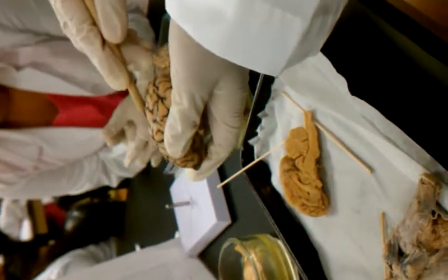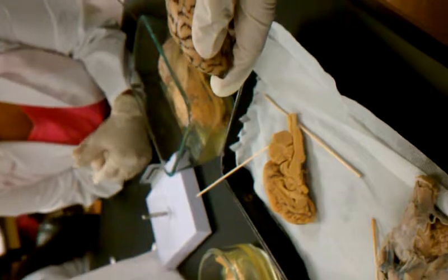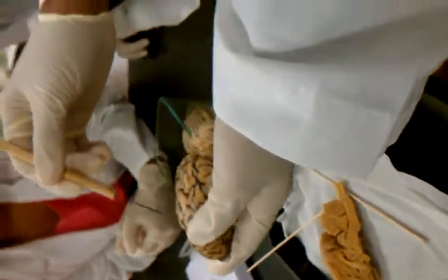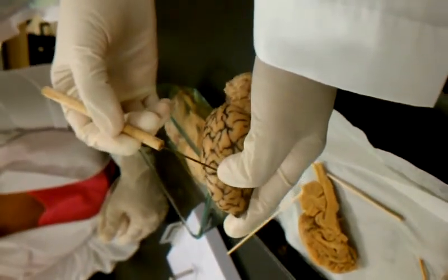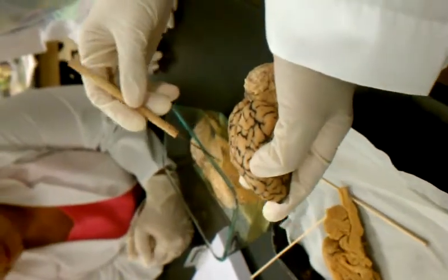Longitudinal fissure. Right here. Is it gyri? Plural, gyrus. Gyrus. All this elevation. Okay. Sulcus. All the depression, the grooves. Okay. Parietal lobe.